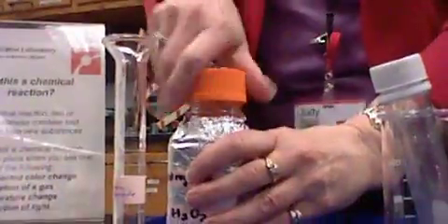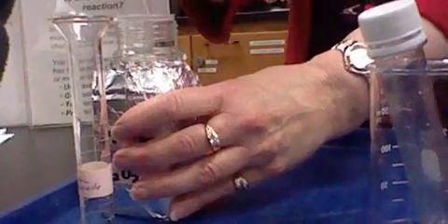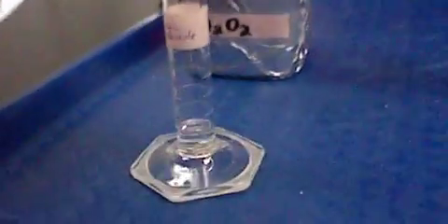Now you're going to do the same thing, but can you see the number 3? Yeah, get it up to number 3. We have to have a certain amount of each. Right. Good observation. So let me move that. Squeeze it first, and hold it. Then dip it in. Keep going. Now release. And now pull it up, and then start to fill that up. And watch where the number 3 is.